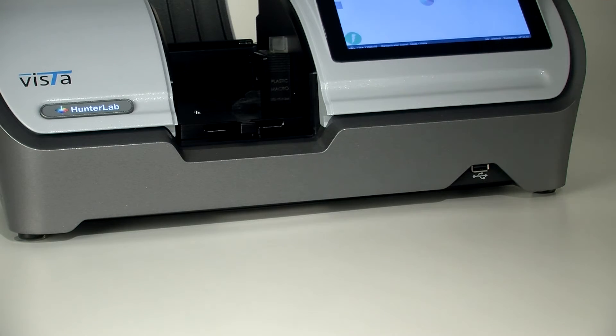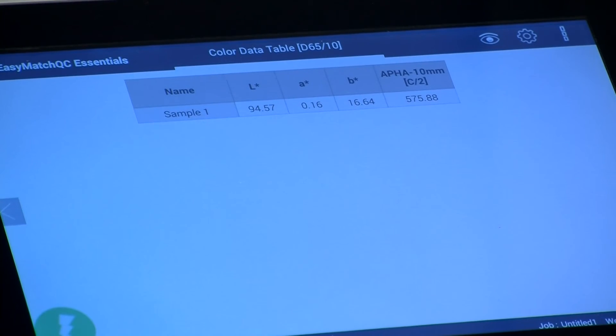Now press Measure. APHA will be displayed on the screen.